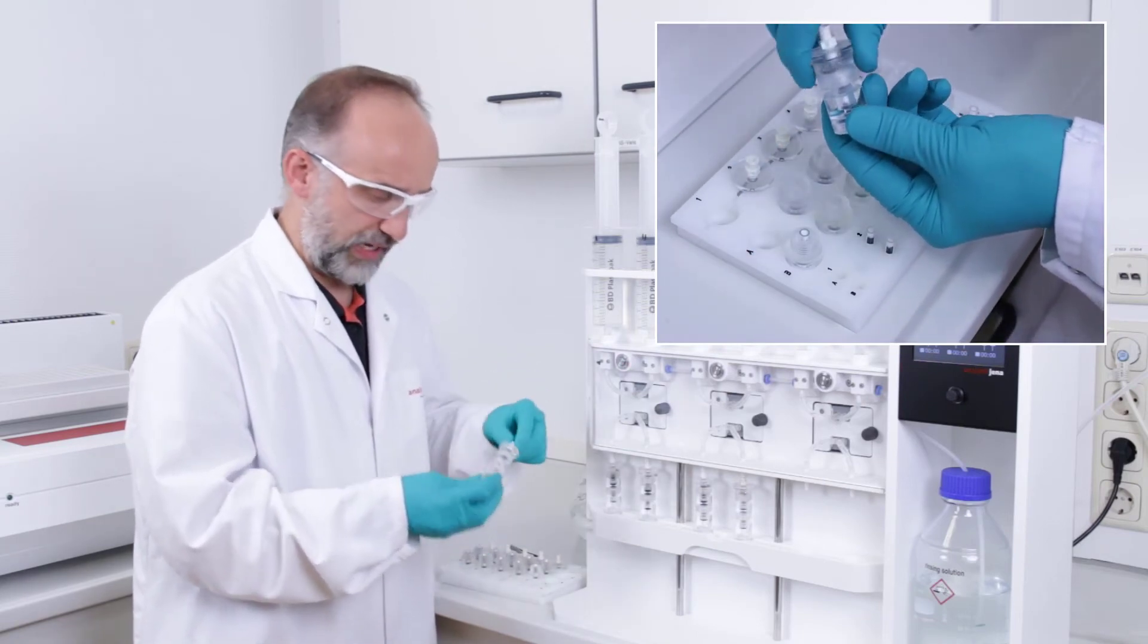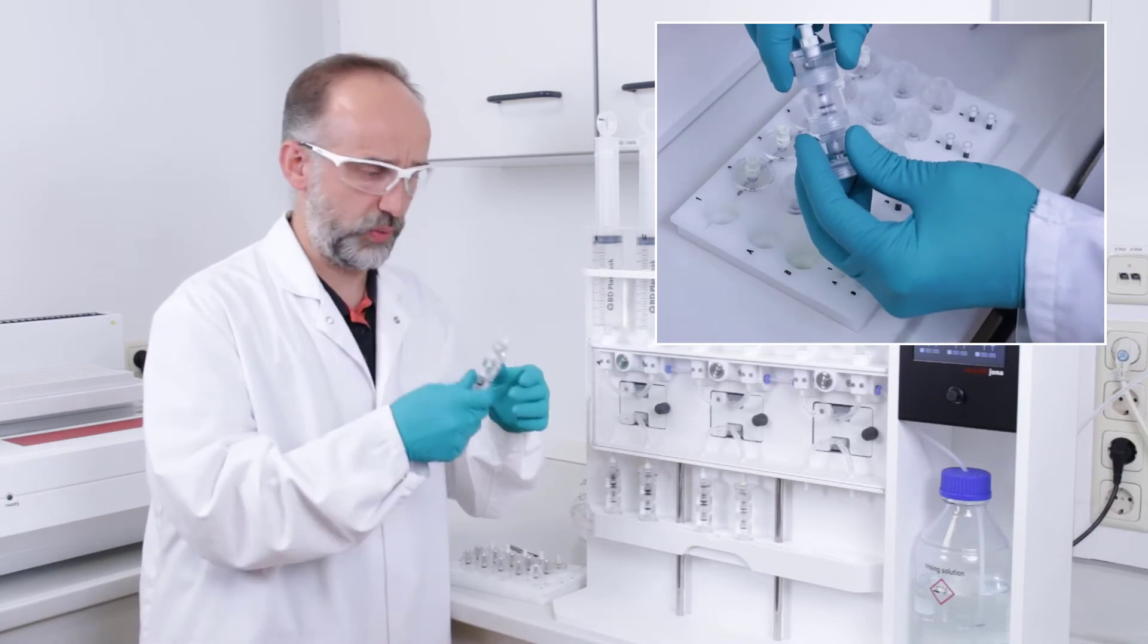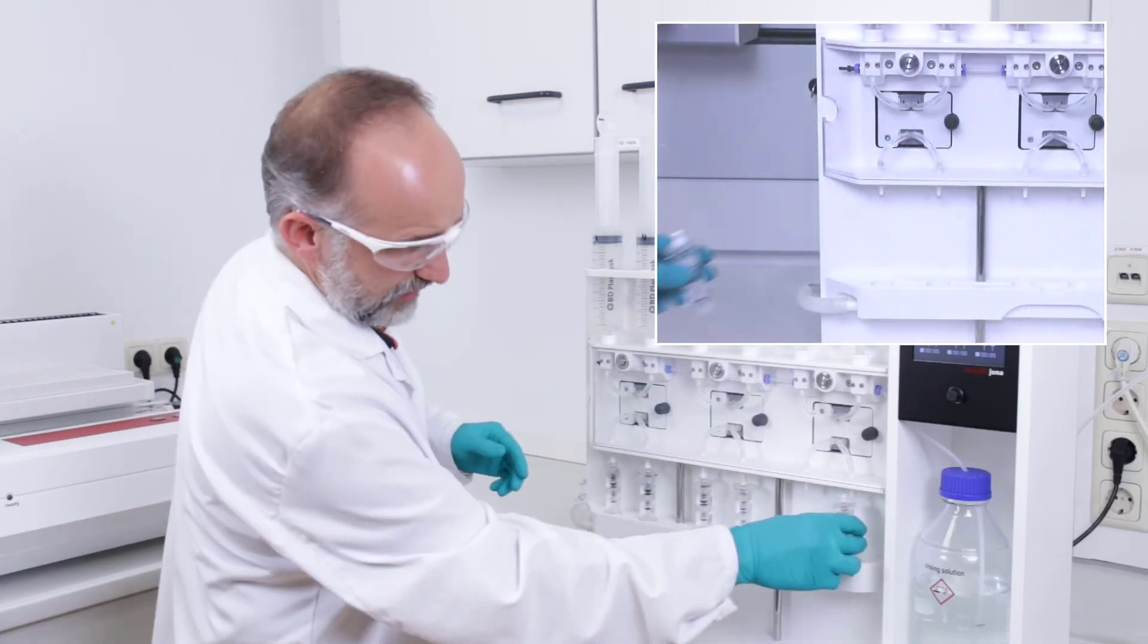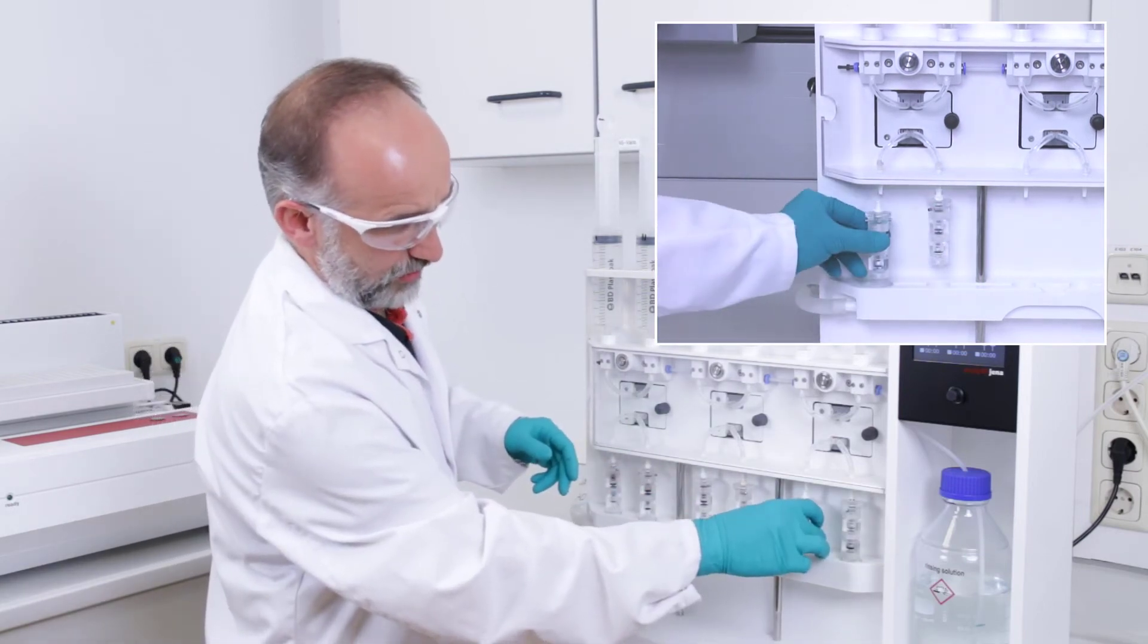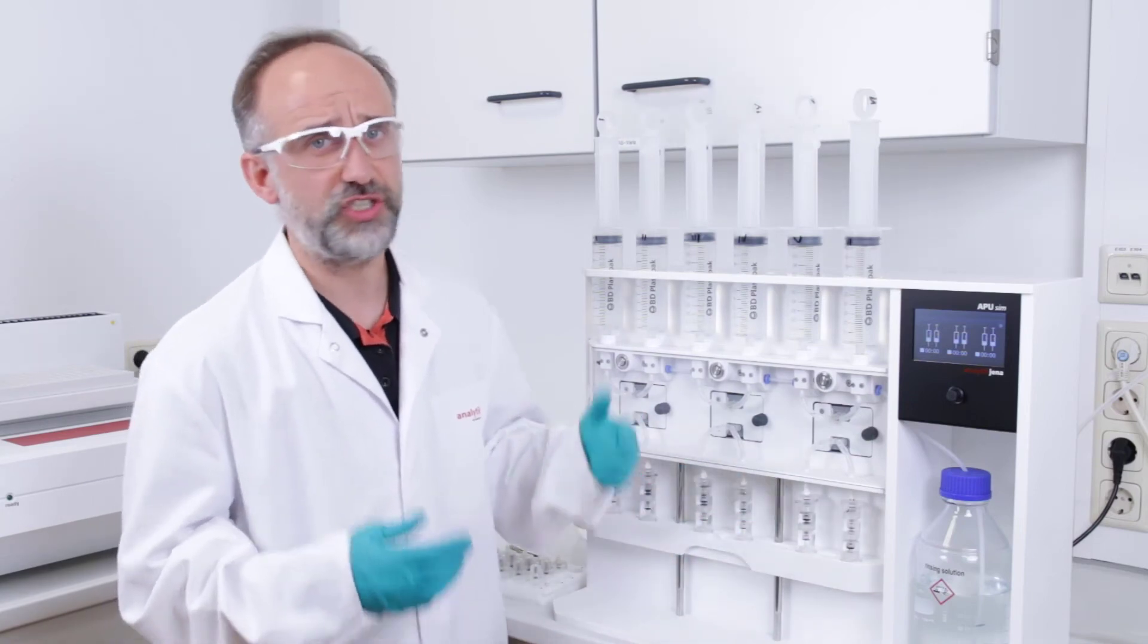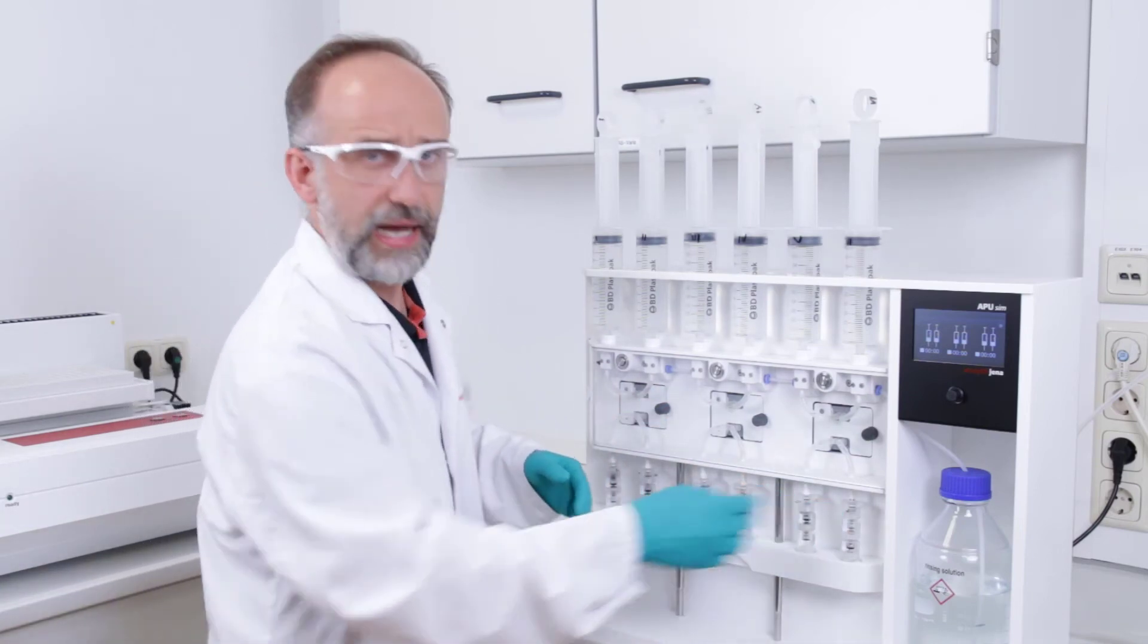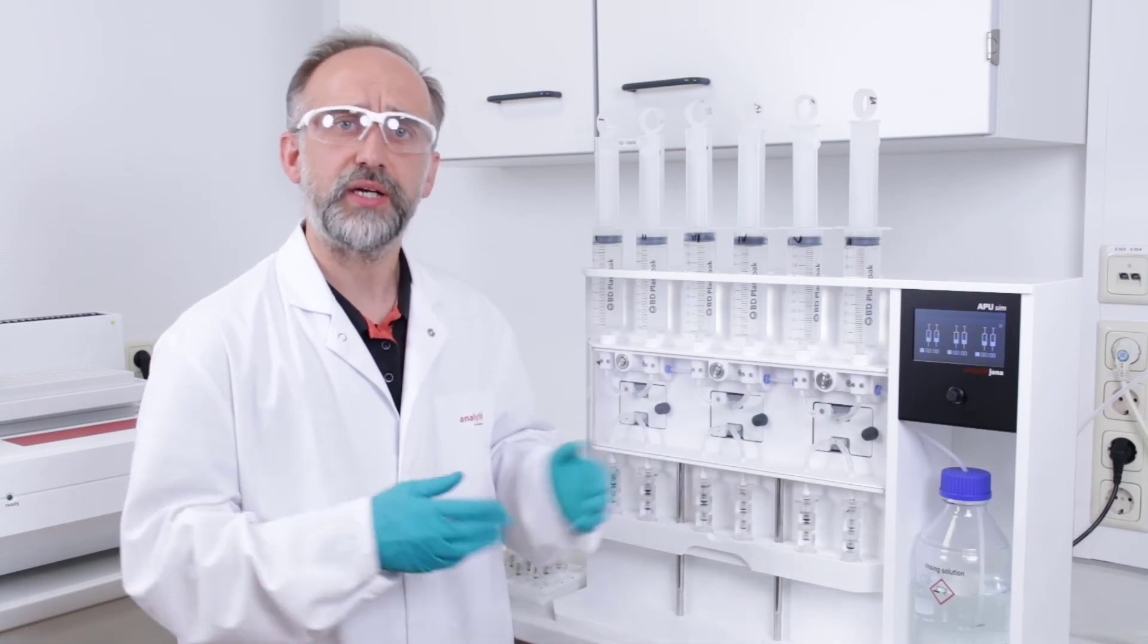So after we have everything mounted together, we have our duplex column here available. Then we can put it directly to the position where it belongs to and then we can go ahead. The Luer-lock connection is quite simple to add the containers and to remove the duplex column in the same way quite easily.